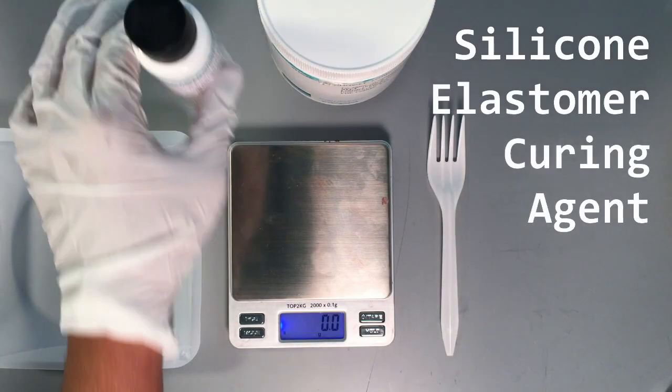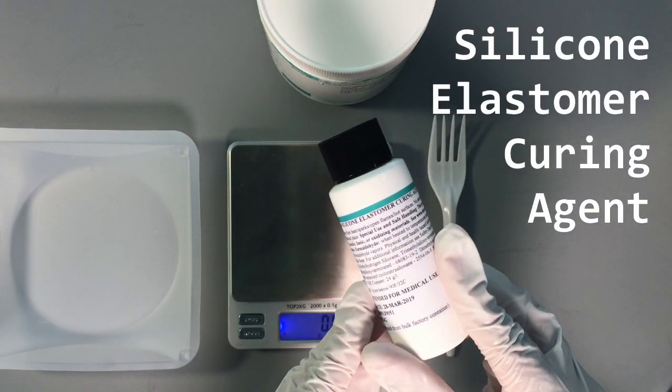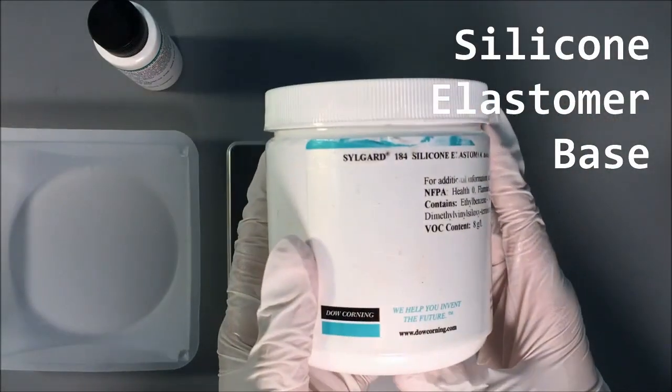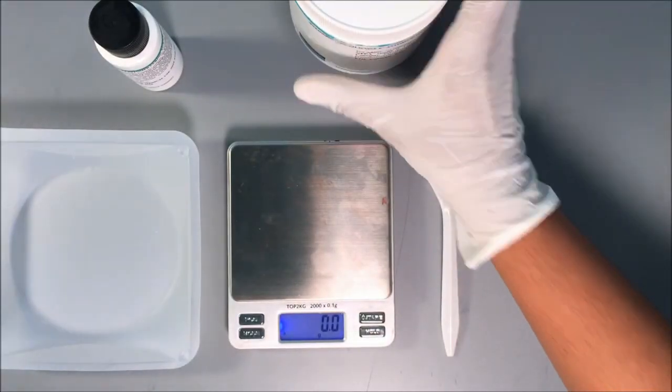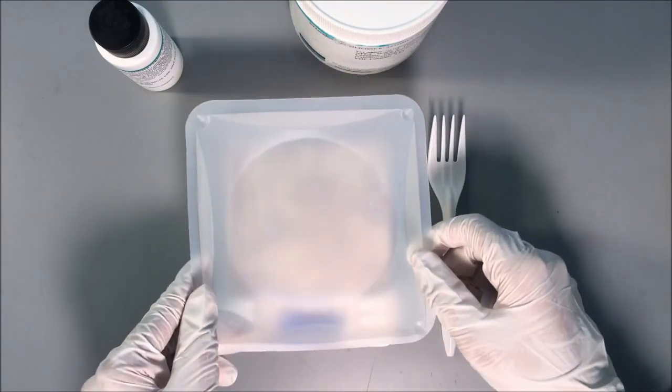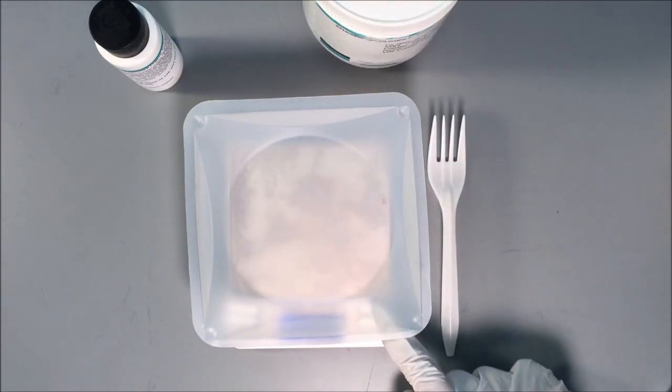You will need silicone elastomer curing agent and silicone elastomer base. Turn on your digital scale and place your plastic weighing tray on it. Make sure you've tared.